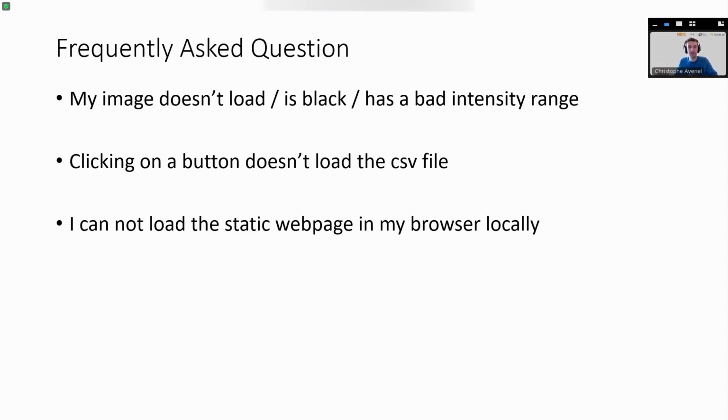But sometimes it can fail. It can fail to find the correct range, or your format is not recognized by TissUUmaps at all. And TissUUmaps is using the VIPS library to convert it, so some images are just not supported. So the best thing is to use other tools that are good at converting images. For example, you have Bio-Formats. You have, like in ImageJ, you can load your image and export it into a format like TIFF in 8-bit, so that you can choose your range as you like it to display it in TissUUmaps.